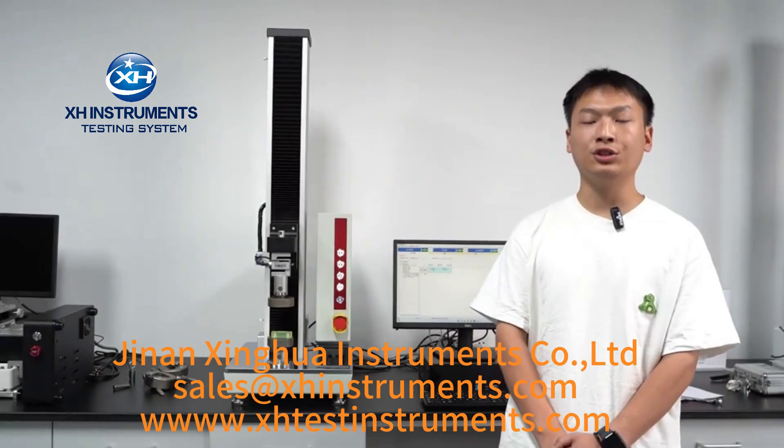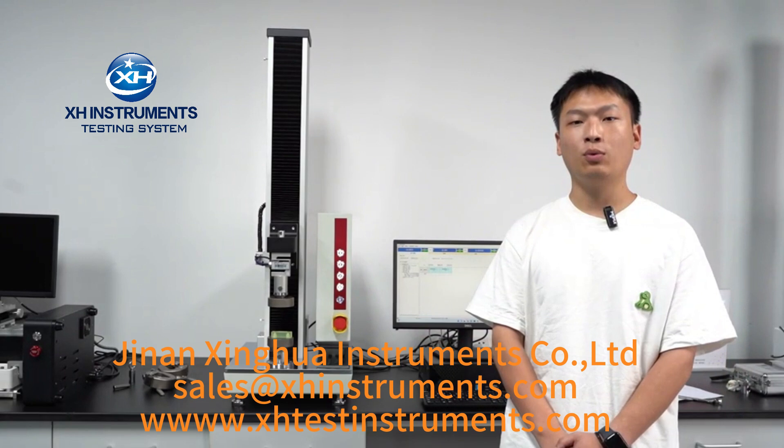Hello everyone. In this video, I will introduce our high-precision tensile testing machine to you. After watching this video, you will learn about the basic components, startup methods, and main safety functions of the experimental system.